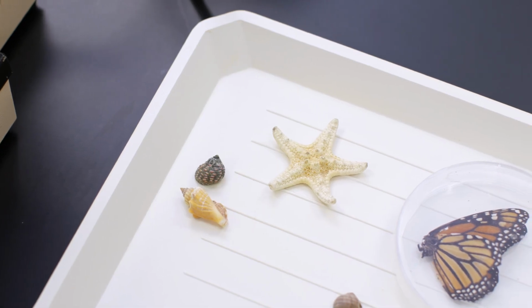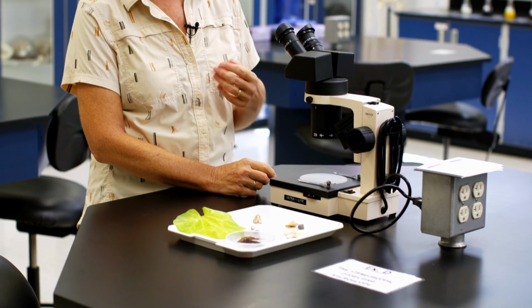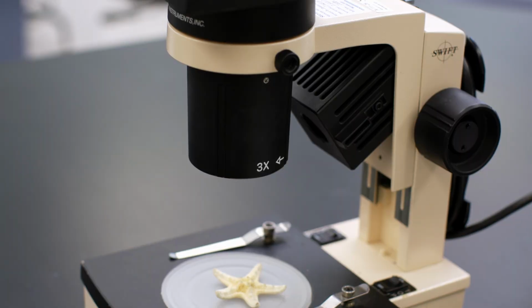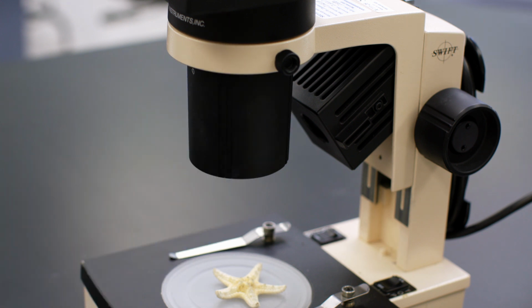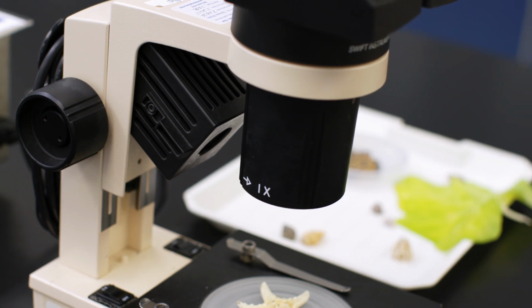This microscope is not something that gives you as close of a view. In other words, it doesn't have as much magnification. However, it starts with the ocular, which is, again, 10 times magnification. But this is the main lens down here, and you have two choices. You have 3 times, which would be 30 times magnification, or if you turn it, it's 1 times, and that would be 10 times magnification only.